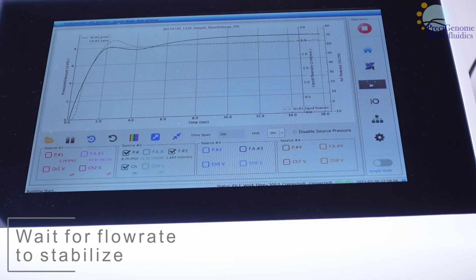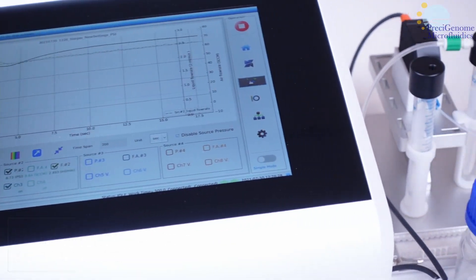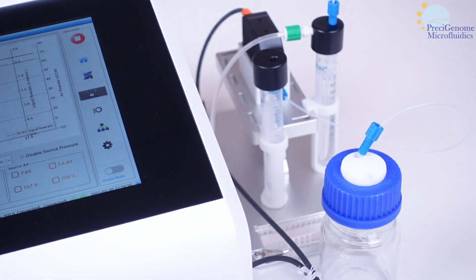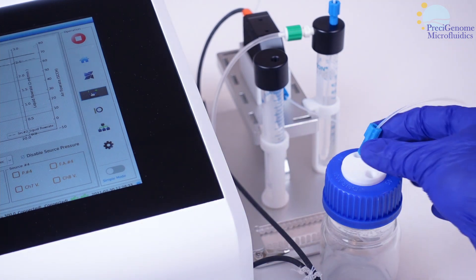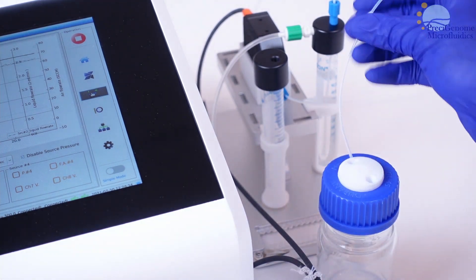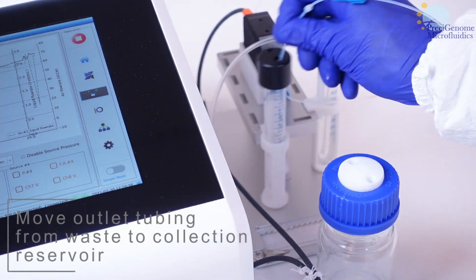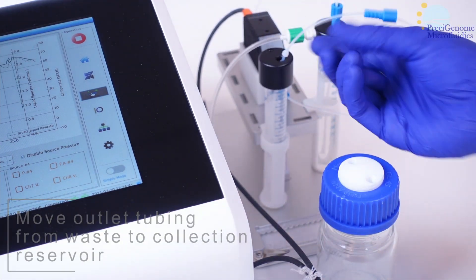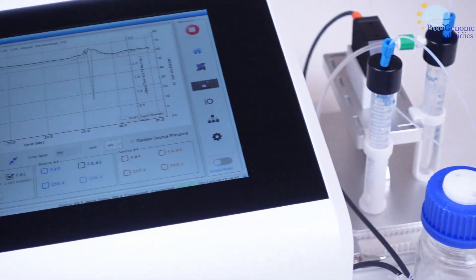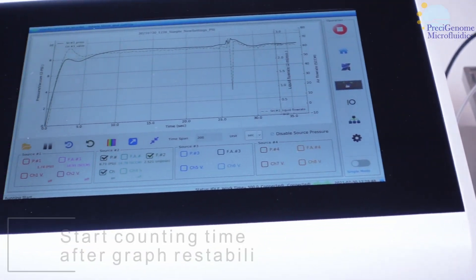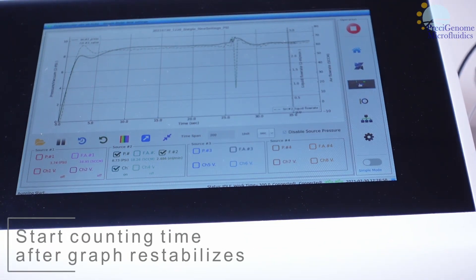Watch the live feed and wait for your flow rate to stabilize. When this has happened, quickly transfer your fluid outlet tubing to the collection reservoir. Wait for the live feed to stabilize again, and then start measuring time.